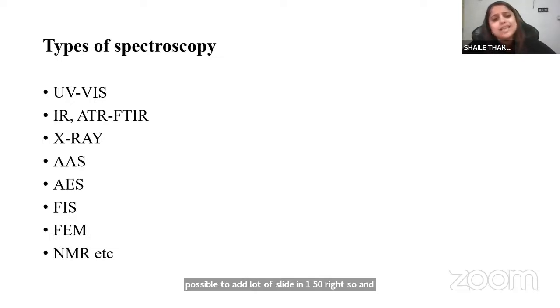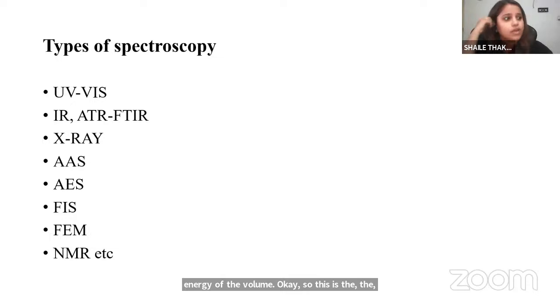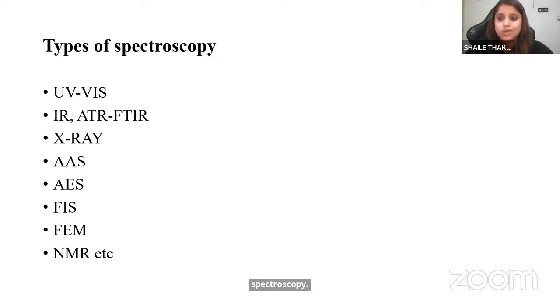If any student faces any problem, you can ask me, or sir can contact me for the PPT, okay? So we have three types of IR range, basically near, mid, and far. Okay, and yes, the principle of IR is related to the vibrational and rotational energy of the molecule. So this is the principle of IR. Therefore, IR is known as vibrational rotational spectroscopy. Okay, so I'm talking about the basics of IR.